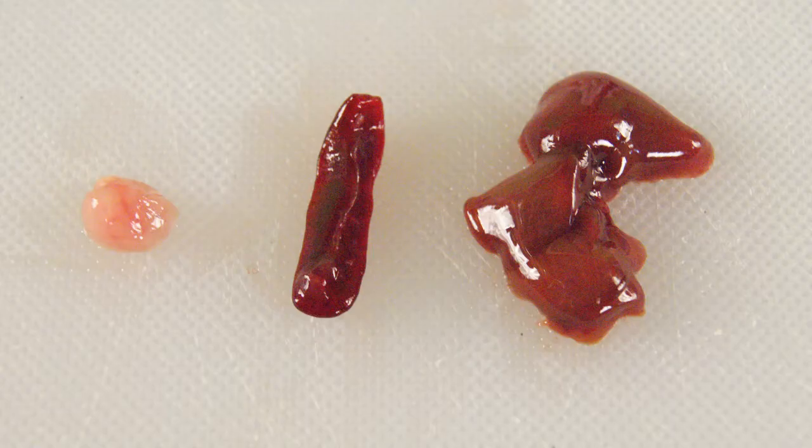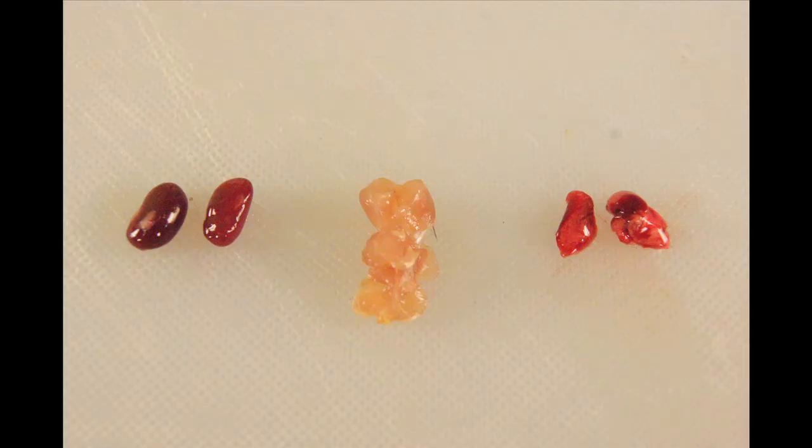A soft tissue is one that can be very easily cut with a scalpel, knife, or scissors. Examples of very soft tissue include brain, spleen, and liver. Examples of medium consistency tissues include kidney, muscle, and lung.